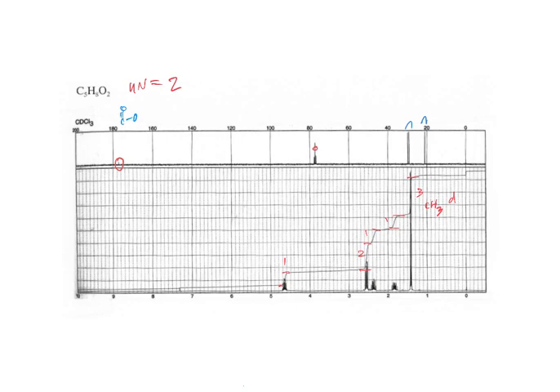So how do we come up with our second unsaturation? Double bond or a ring? Those are the two ways we could do it. Do we have any double bonds? We should, because there's a signal at like 4.8. Do we have any double bond carbons? Well, at 80, right? Is that good for a double bond carbon? No, it's not, because double bond carbons are going to be down in here. So we don't have any of those. So I think we have to have a ring.